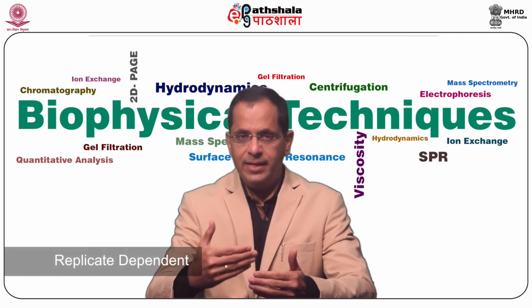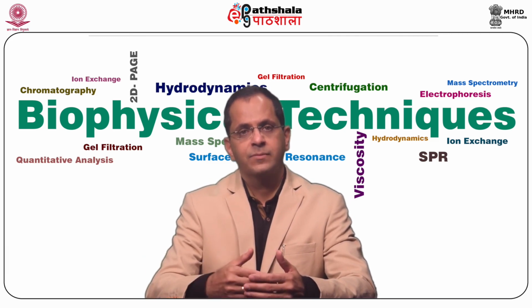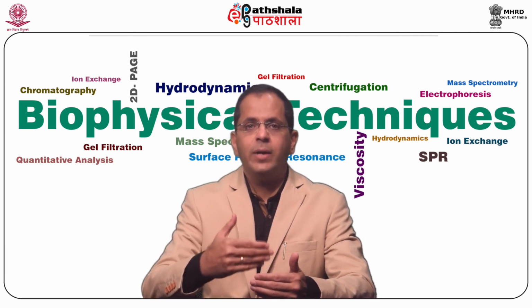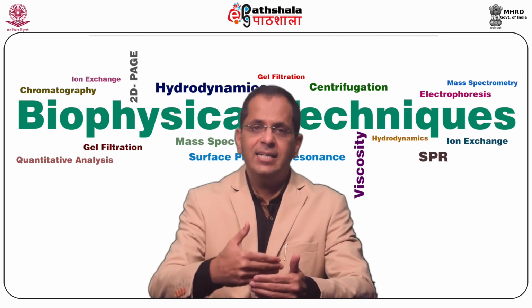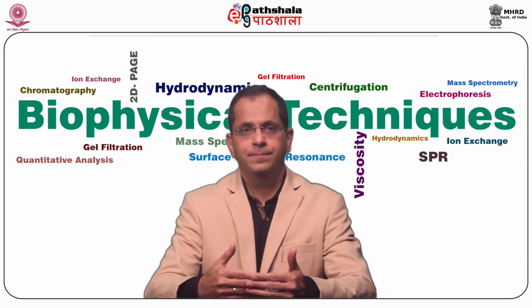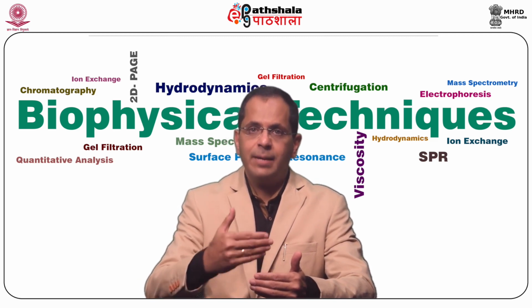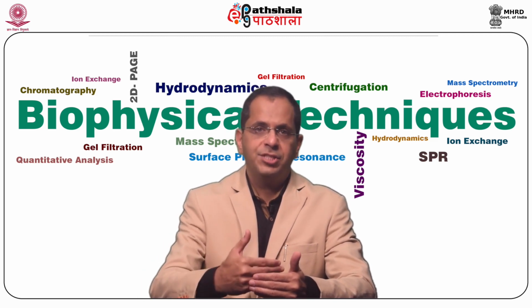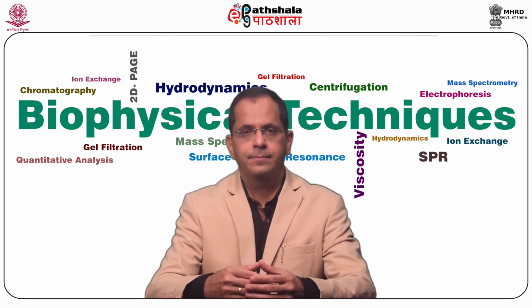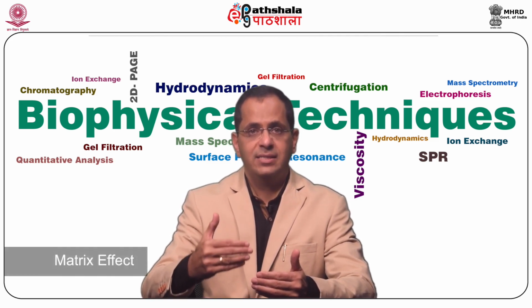Disadvantages. Replicate dependent makes it very difficult. The susceptibility to errors due to parallel sample processing and analytical variability. It becomes mandatory to carry out sample preparation and MS data acquisition cautiously. You come onto a particular problem called the matrix effect.